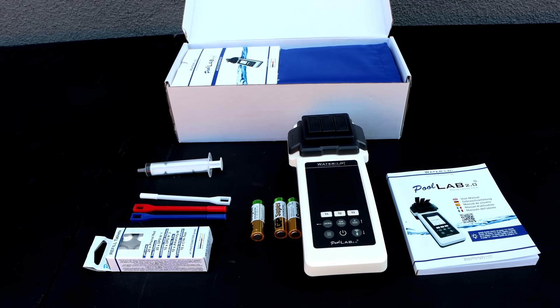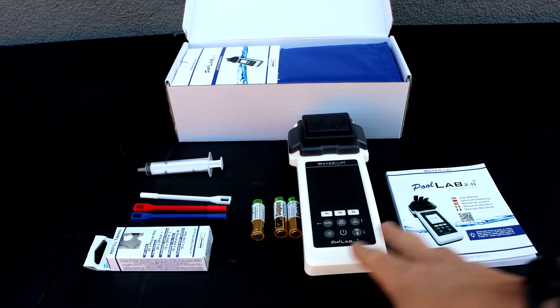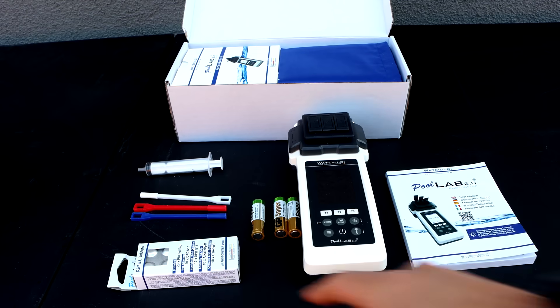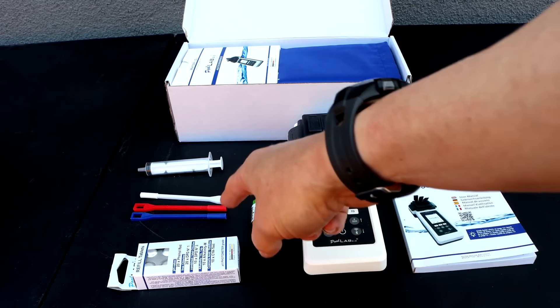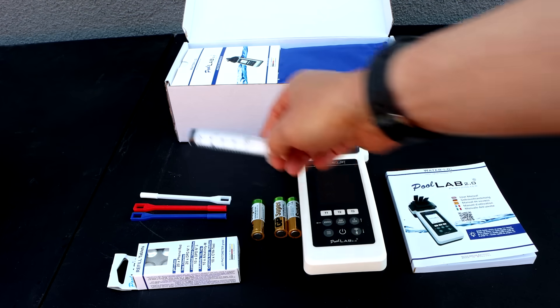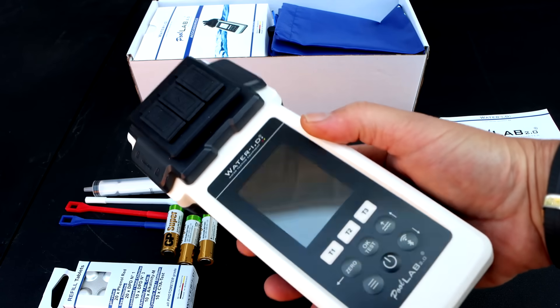In this video I'm going to show you the Pool Lab 2.0 photometer. In the US market you're going to be able to buy this under the name Water Tester. In the box is the manual, the photometer itself, batteries, some tablets, three different crushers, a syringe for the water sample, and a nice storage bag.